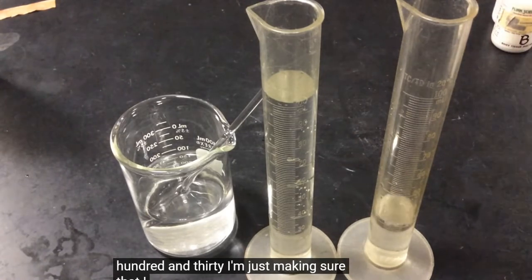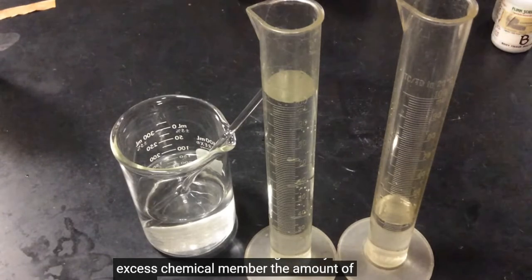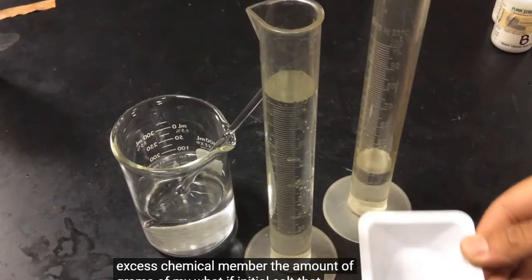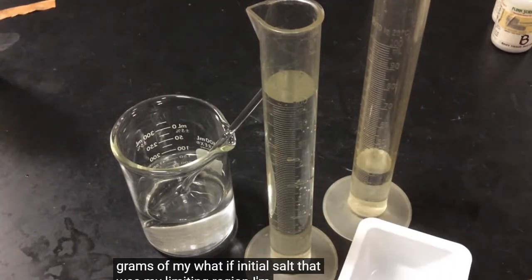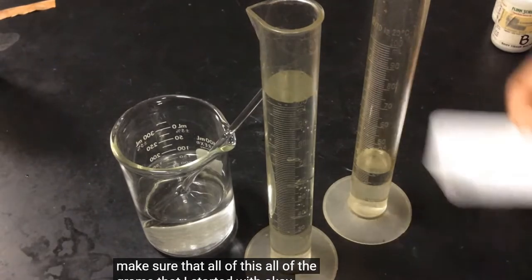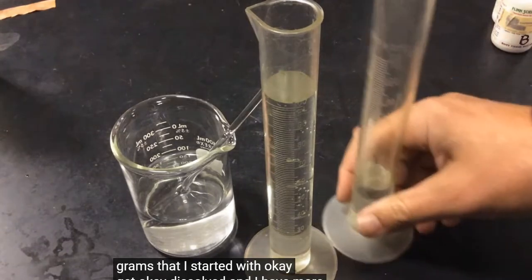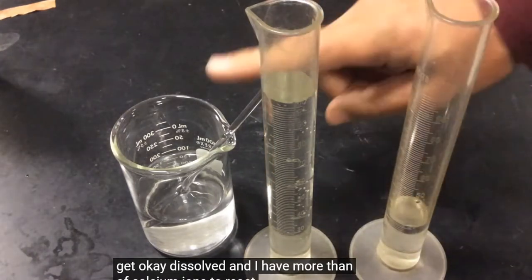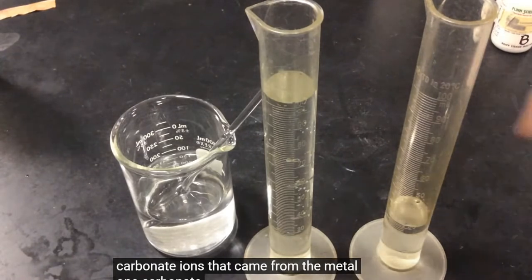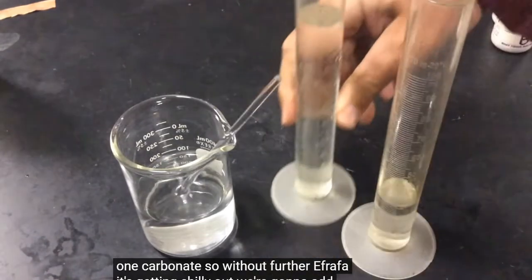Remember, the amount of grams of my initial salt was my limiting reagent. I'm trying to make sure that all of the grams that I started with get dissolved, and I have more than enough calcium ions to react with all the carbonate ions that came from the metal carbonate. So without further ado, it's getting chilly out, we're going to add this together and make our precipitate. So let's do that.